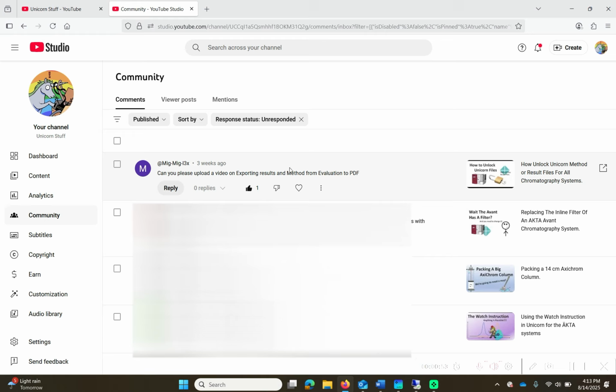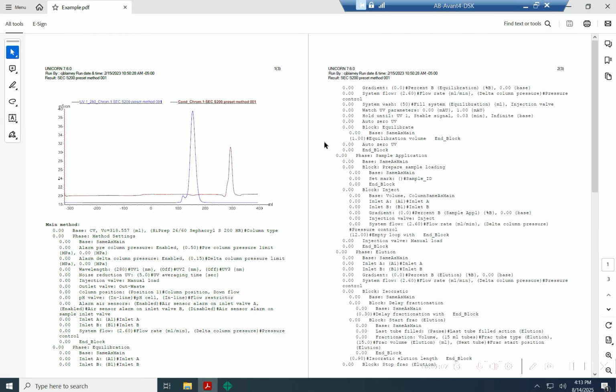Today I want to talk to you about a request a viewer made, which was, can I upload a video about exporting results and method from the evaluation into a PDF? While there are some ways to interpret that question, this is kind of what I imagined they wanted.